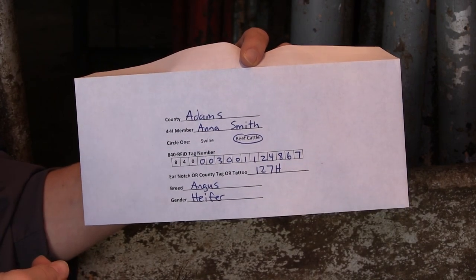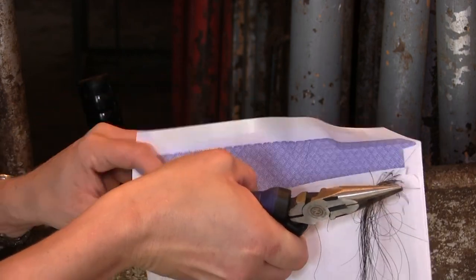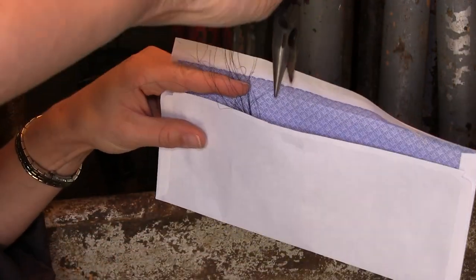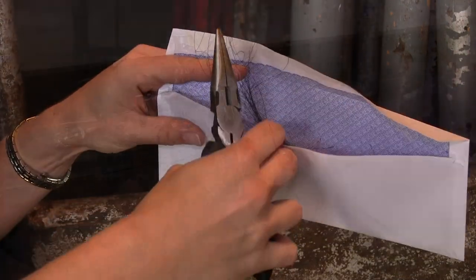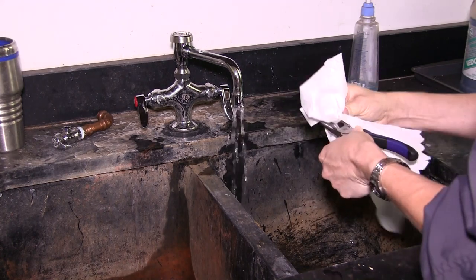Place your hair sample directly into the self-sealing collection envelope. Avoid touching the roots and using plastic bags. Then fill in the appropriate information on the envelope. Repeat this process for the remaining animals. Clean and dry the pliers and your hands between each collection to prevent contamination of the sample.